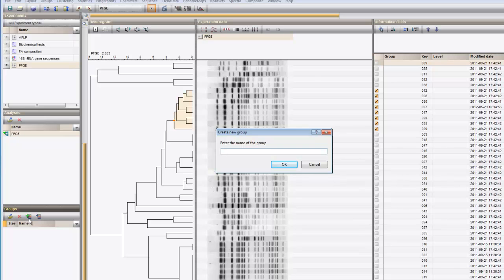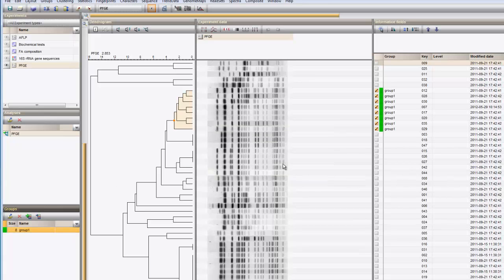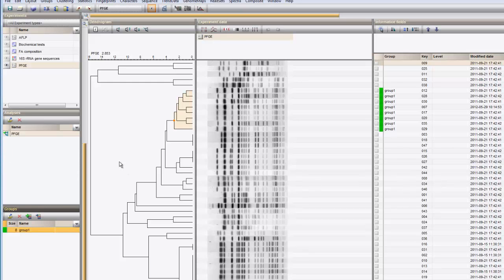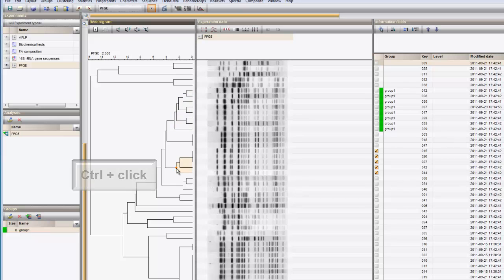I can enter a name, and the created group appears in the Groups panel. Similar for a second cluster. I clear the selection with F4, Ctrl-click on the second cluster, and create a second group.